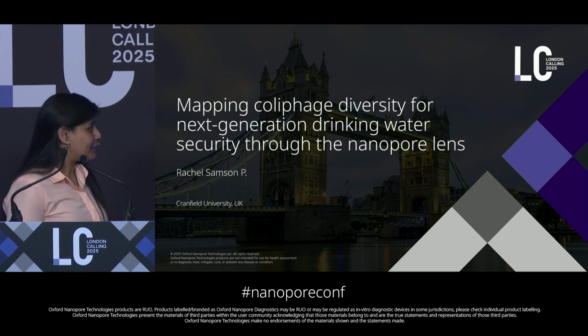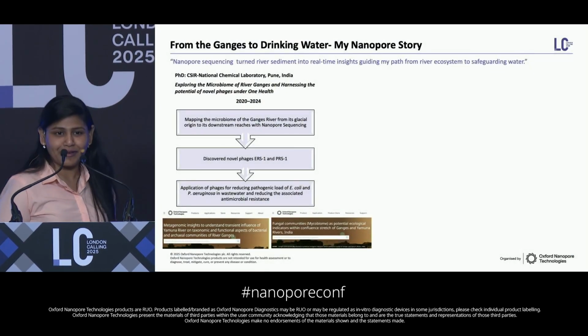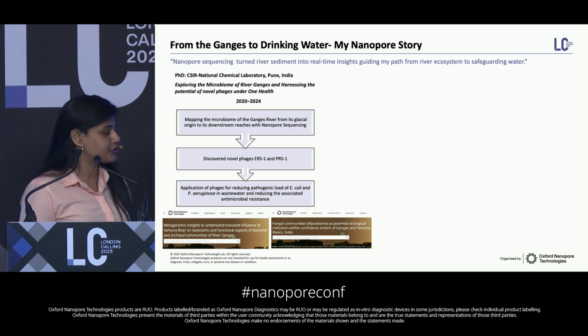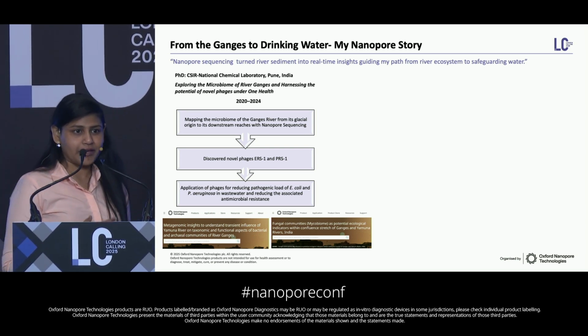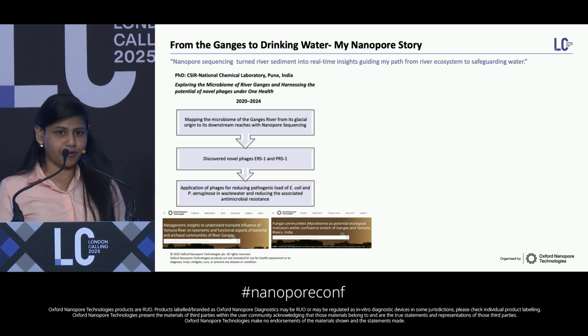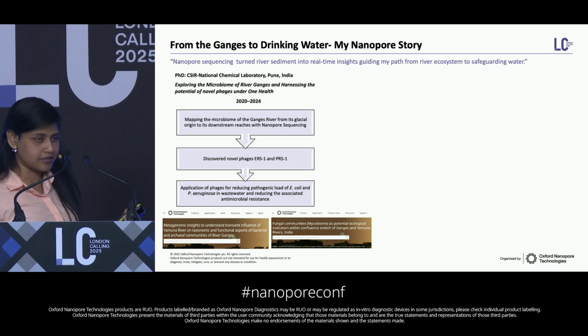Thank you for introducing me, but this is a brief background of how I got here. Basically, my PhD dealt with the Ganges River, and at that point of time, I used Nanopore to deal with the metagenome, microbiome, virome, and the phageome of this riverine system.